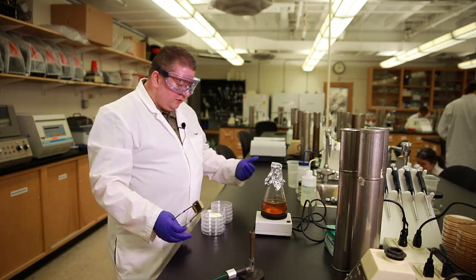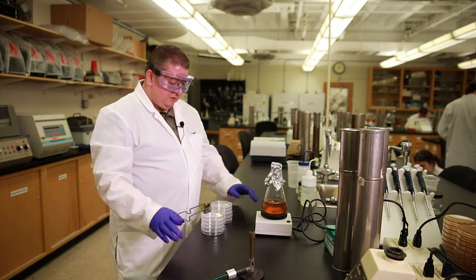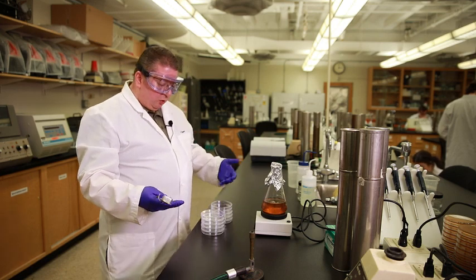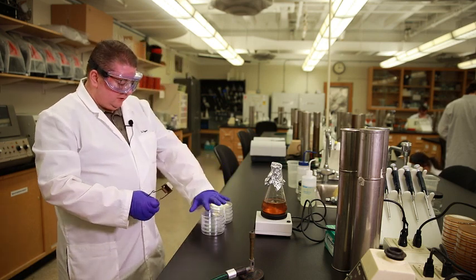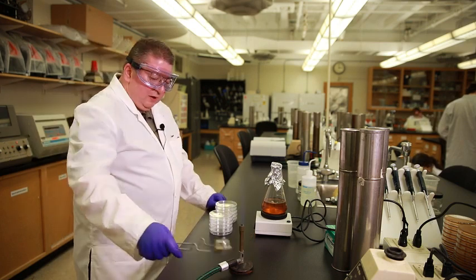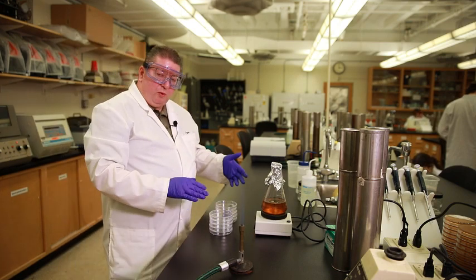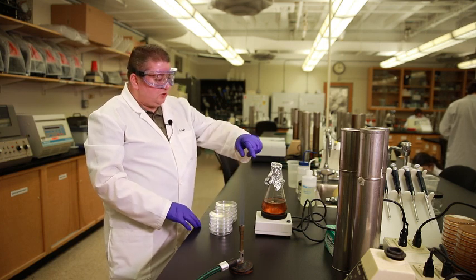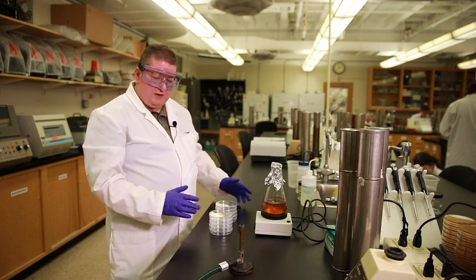Now I have to do this aseptically. So the bench has already been cleaned with a disinfectant. We don't want to introduce any airborne contaminants into our plates. These petri dishes are sterile. Now there is a potential that when I pour the agar out of the flask into these dishes, I could introduce contamination that may be on the outside surface of this.